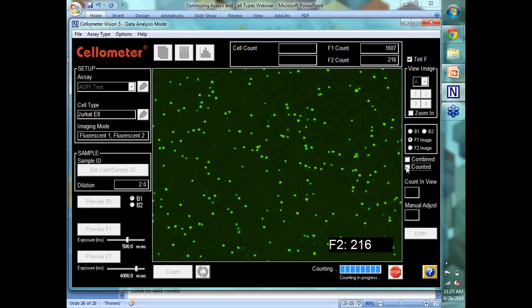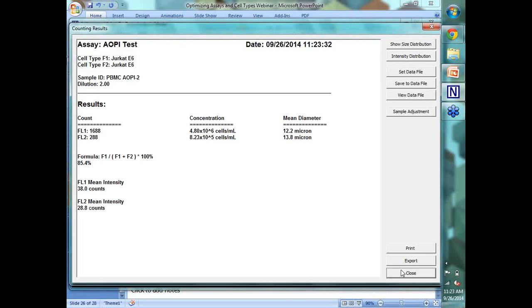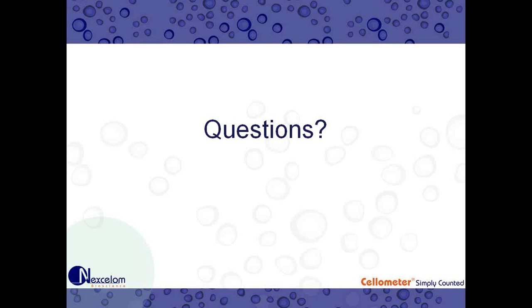We'll check this really quick, and then we'll open it up for questions. Just look at all those ones that got excluded. Whoa. Okay, so that was our live demo. Any questions?